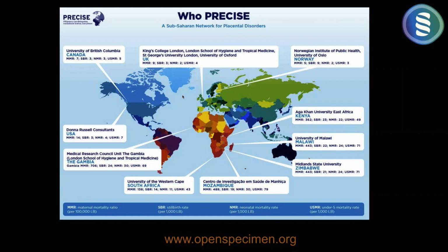The clinic coordinators go to different collection sites, off site, outdoors, or to clinics outside the hospitals, to collect specimens from pregnant women and children, and the specimens are then sent to the lab, processed, stored, etc.